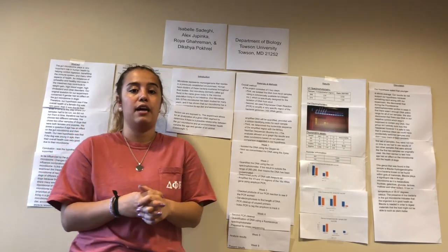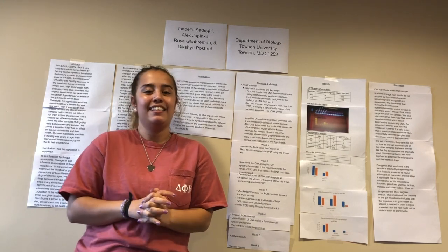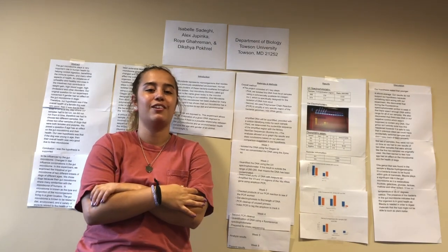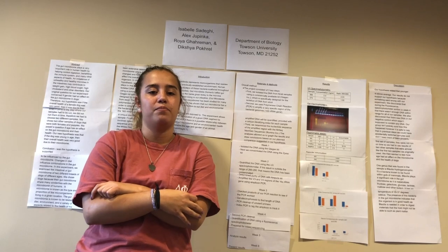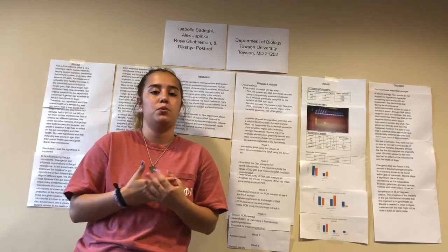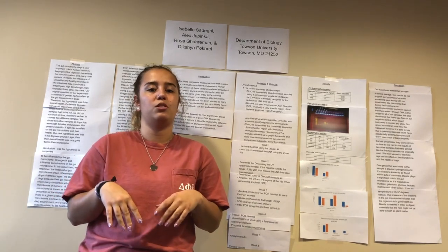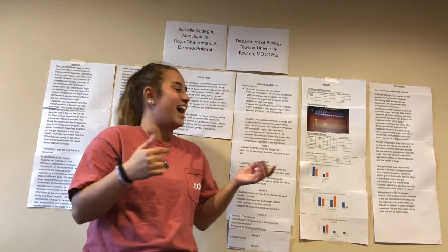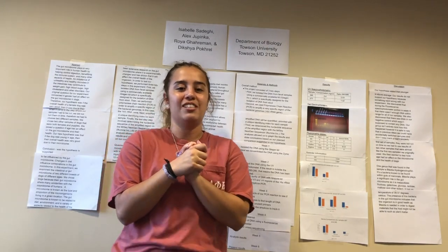Sample 343 had Bacteroidaceae, and sample 307 had Bacteroidales. Bacteroides in sample 307 had a majority percentage, and the genus level in sample 343 was 7.32%, in the genus of Bacteroides.